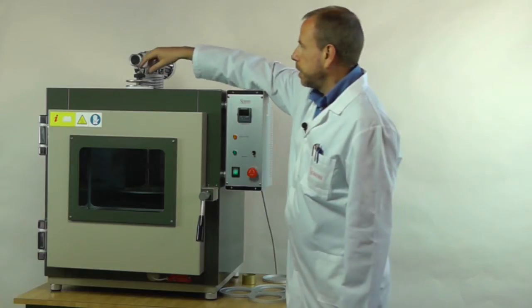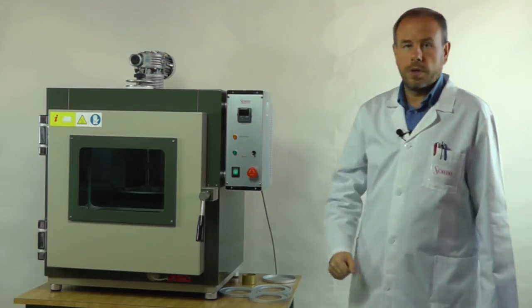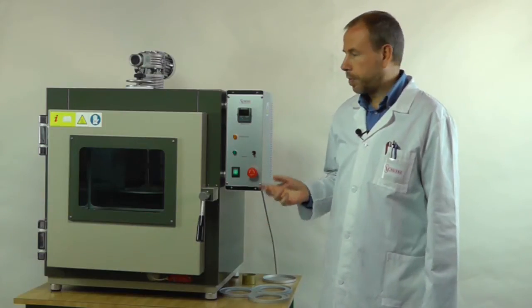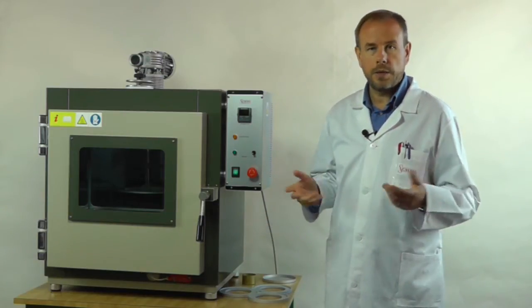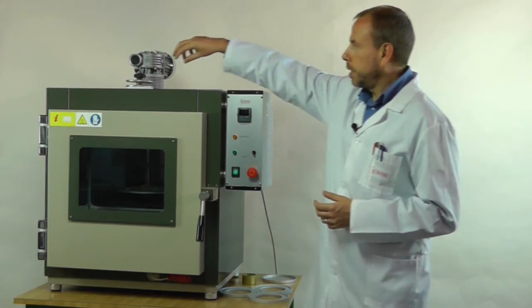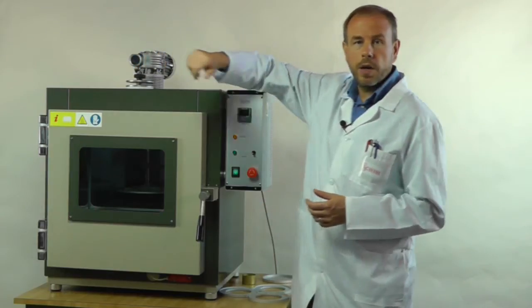In front of the motor we have this vent port. Being a convection oven, air comes in from the bottom, is heated by the heaters and comes out from this port. The port can be easily closed while not in use.